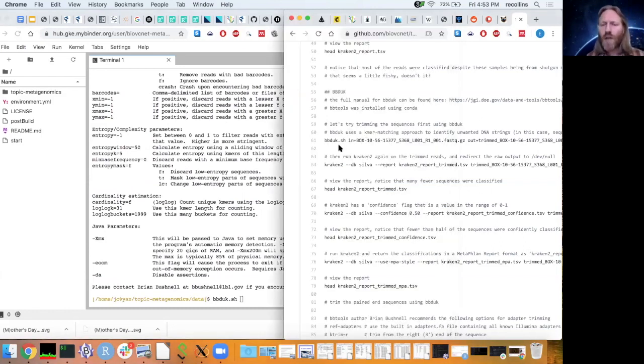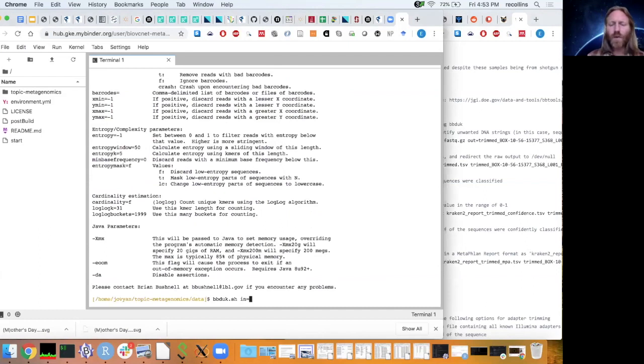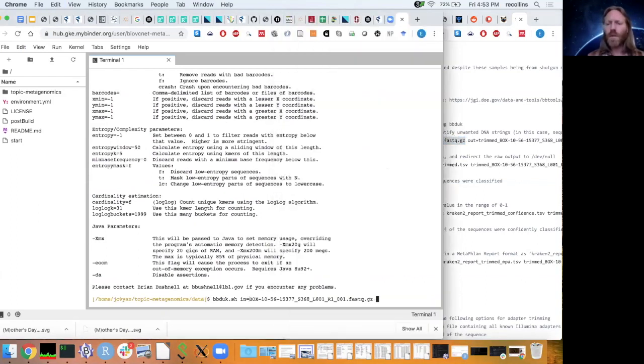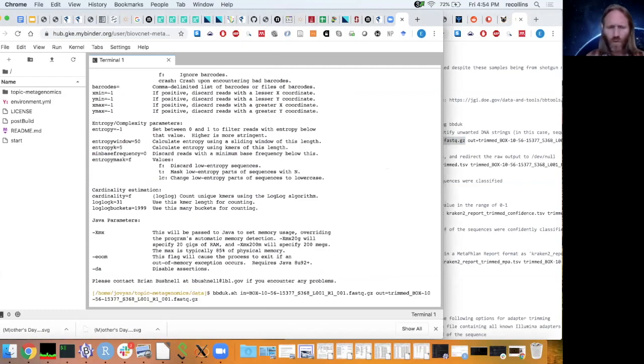So let's try just, again, this one sample that we were working with before. We'll rename it to a trimmed version.